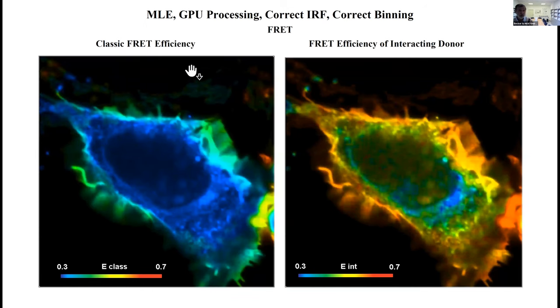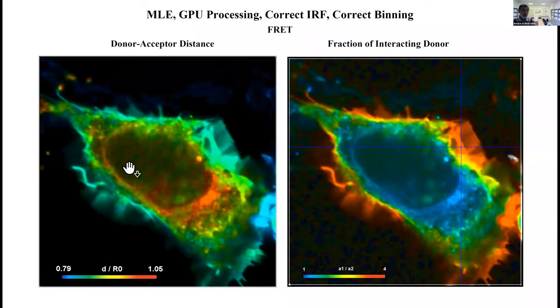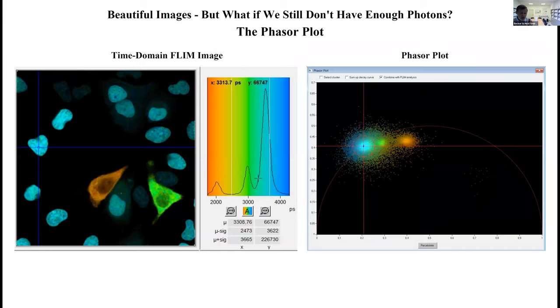Here's a FRET example. Double exponential decay analysis. The result is you get classic FRET efficiency, you get the FRET efficiency of the interacting donor, you get the donor-acceptor distance, and you get the fraction of interacting.